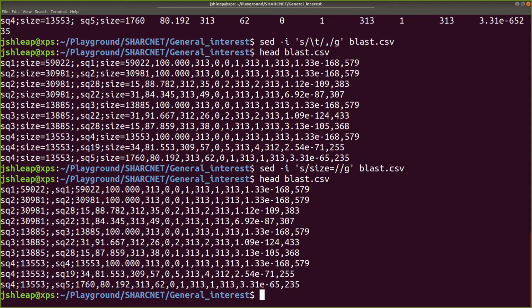And you can actually do multiple manipulations like this, and it's going to be a lot more useful than opening a file in a text editor and going line by line looking for the patterns that you want to remove, right? In bioinformatics, often the way the names of the sequences are set causes problems for some programs. So knowing sed is really good to know.